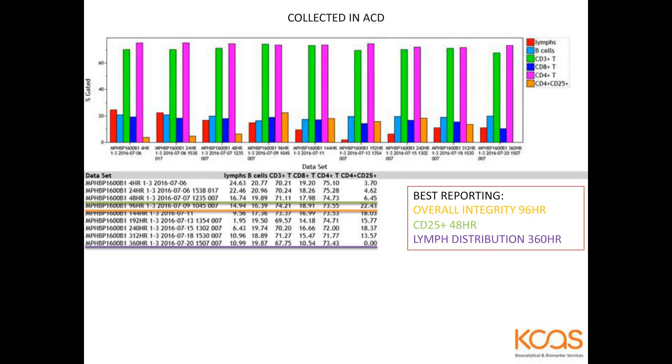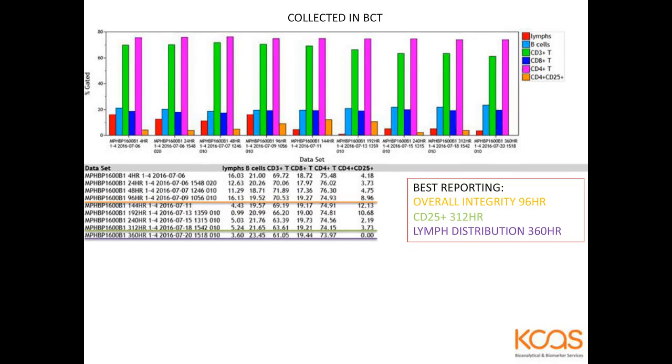If I'm going to do a study and just report out surface or intracellular markers, I'm probably going to go with a BCT tube because it's fixed, and I actually received samples that were frozen accidentally, and because they had been fixed, the epitopes were still pretty good and the sample looked pretty good. So I'm going to report in my GLP fashion that the samples were not stored appropriately during storage and shipment, but that the markers did look pretty good when I received the samples.